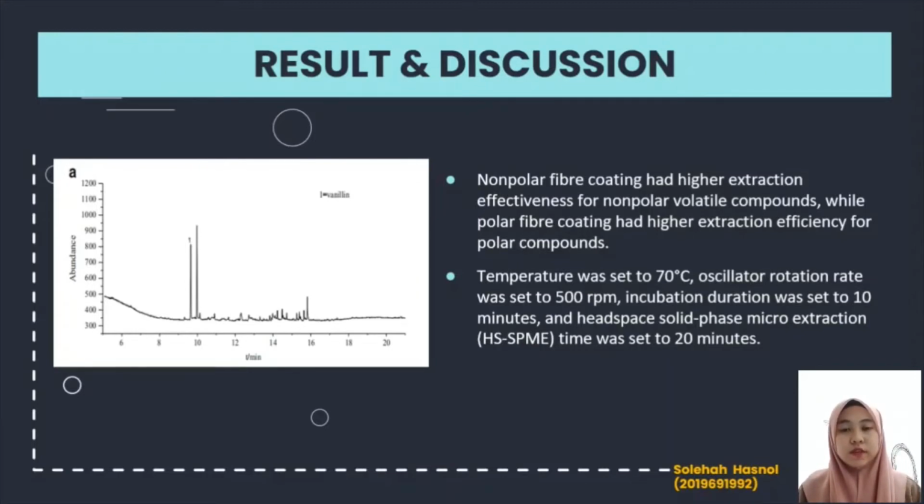Temperature was set to 70 Celsius. Oscillator rotation rate was set to 500 revolutions per minute. Incubation duration was set to 10 minutes and headspace solid phase microextraction time was set to 20 minutes. The effects of 7 different types of extraction fibers on a matrix standard mixing solution were studied under this condition and the findings are presented in this graph.